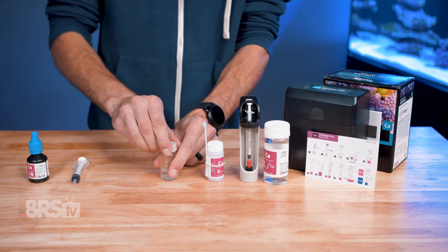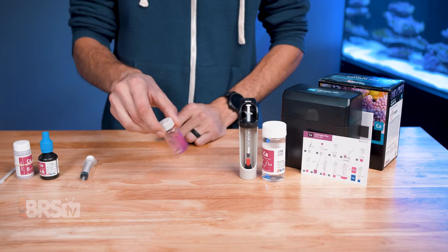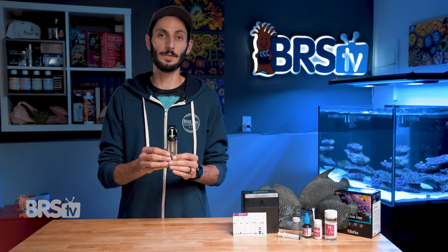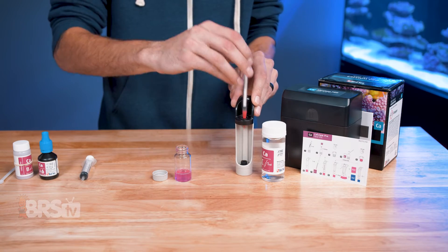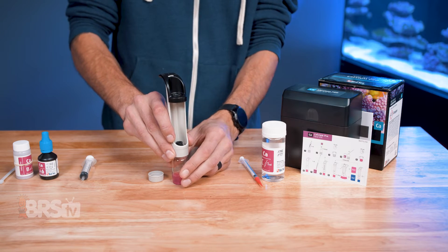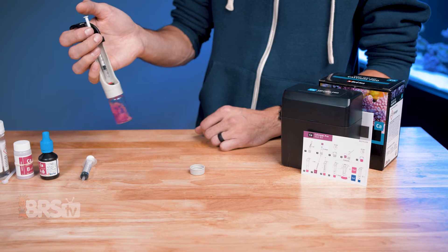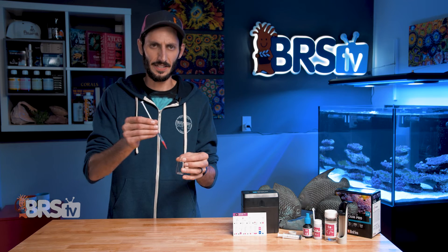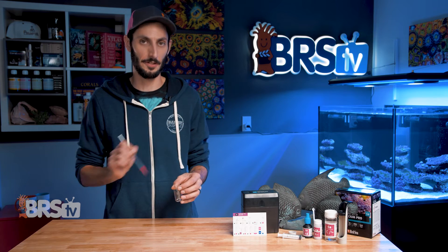Cap and shake the cuvette back and forth, then add a scoop of reagent B, cap and shake back and forth again, and then you're ready to titrate. The titrator that Red Sea includes is one of my all-time favorite testing tools. It screws right on top of the cuvette and has a rubber gasket to prevent any spilling or splashes. It firmly holds the one milliliter titration syringe directly over the center of the cuvette so that you can use one hand to shake and press the plunger on the syringe. I've always found that holding a small cuvette and a tiny syringe is just kind of awkward, and I much prefer Red Sea's solution of using a titrator.